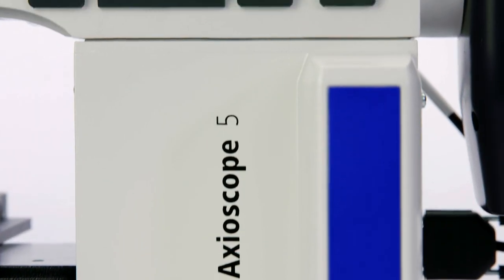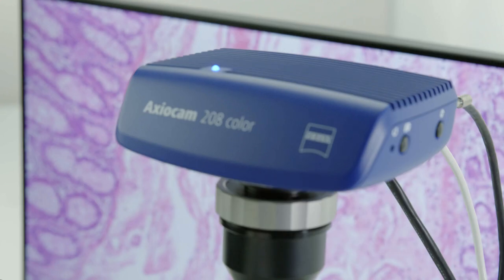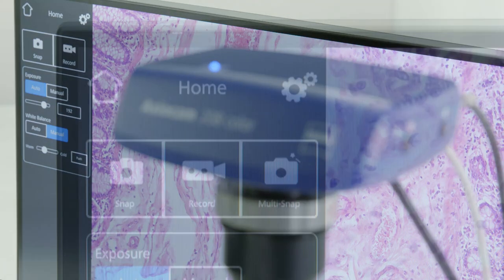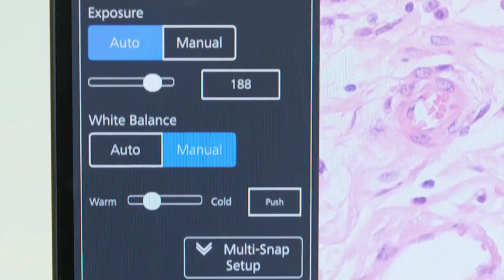With Smart Microscopy and Axioscope 5 from Zeiss, you can do it all in one go. Here's how it works.